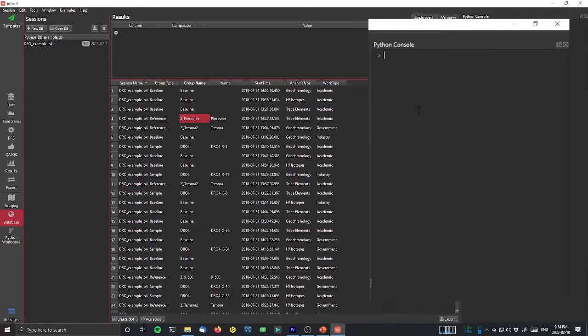So now that we have our array of values that we want to add into the database, we can use db.appendColumn. We'll give it a name, so we'll just say this is plescol, just for some random name for it. We'll say db.specified, because we're only updating certain rows, and we're going to say, like we've done before, select star from results where group name like ples.